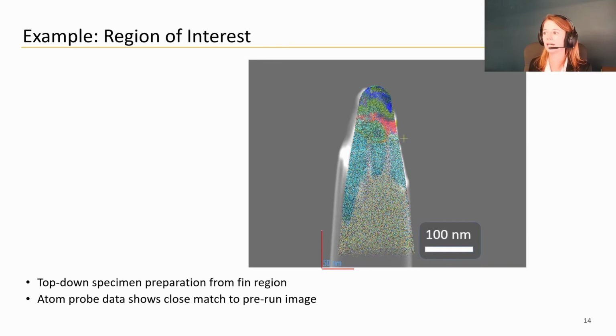Here in red, we have our SiGe region. In our orange ions here is our hafnium oxide. That's a high K dielectric. You can see here our silicon regions here in gray and our silicon oxide in light blue. So we can get a lot of different information from this device, and we have the ability to create 3D elemental data from all these structures.